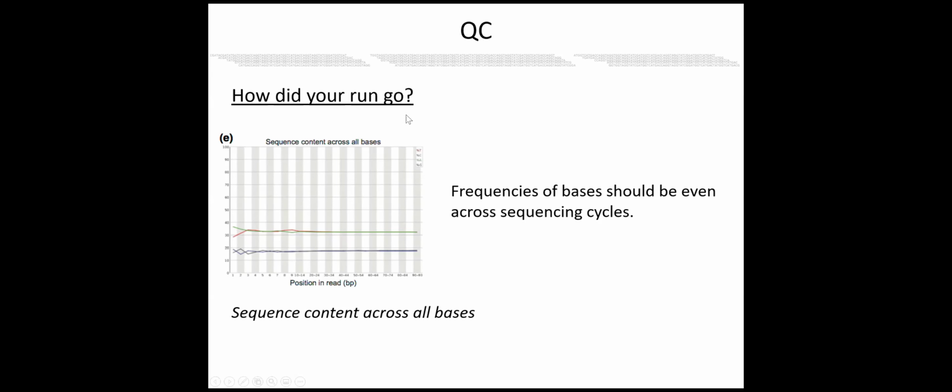So anyway, questions of how did your run go? You're also going to want to look at base frequencies across different cycles. And Marco says not sure, so I'm saying challenge accepted.